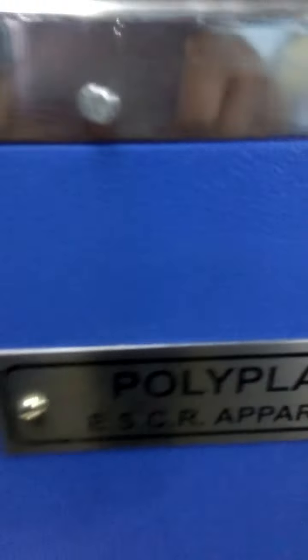Whenever you want, in the middle of testing with the lighting, you can just put it on and it will give you a clear view. You can see whether the crack is expanding or not. This is what the Polyplast ESCR Apparatus does.